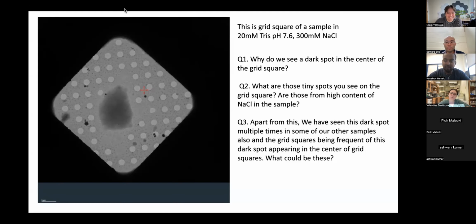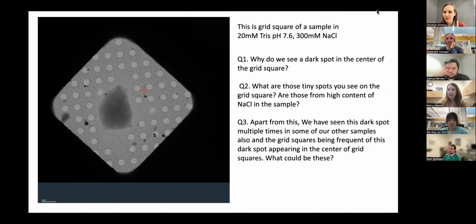I hate this and I see it all the time, and in my experience it's usually very sample specific. Some of my users will have this issue and then they will try a different sample and they will not have that issue anymore. So I've come to think that it's not something they're doing wrong with the freezing, but that it's related to something about the sample itself. I suspect it has something to do with the surface tension and how the sample is spreading, and I'd love to hear what anybody else thinks.